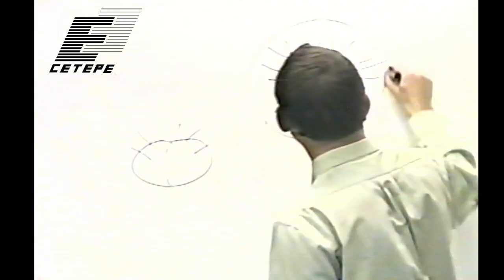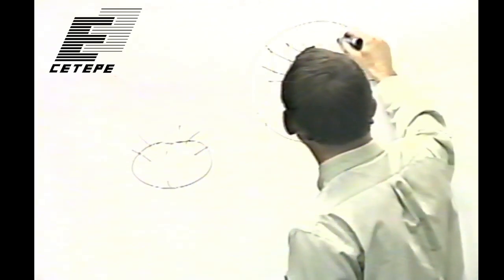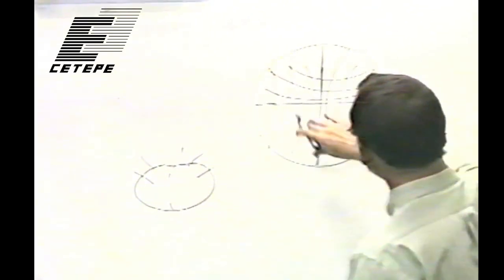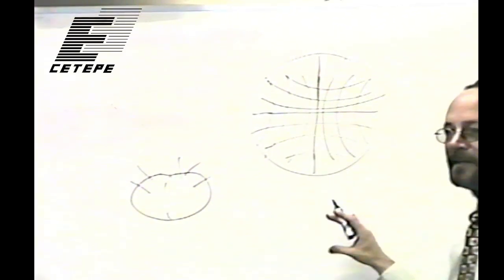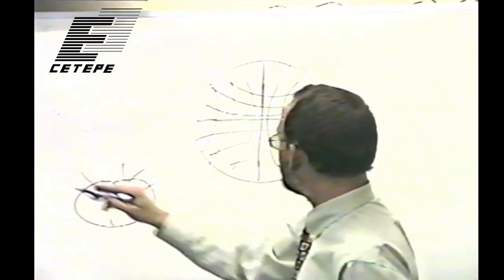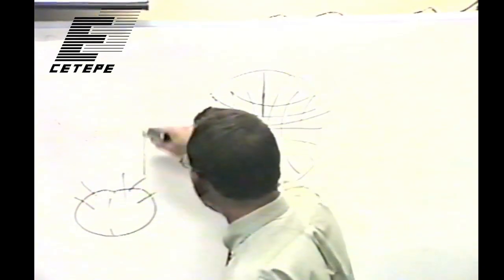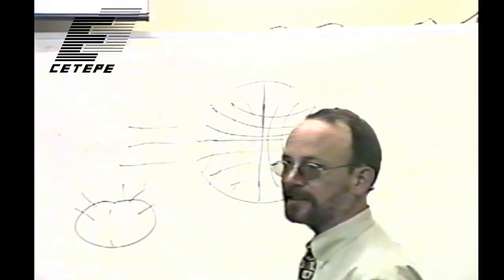So if this was the output. What I'm trying to draw here is, the center lines are pretty straight, but then on each side of the center lines, you get this increasing curvature. Okay, so this is a rectilinear grid. So the output is for an input that was a grid. So this grid would get imaged like this.